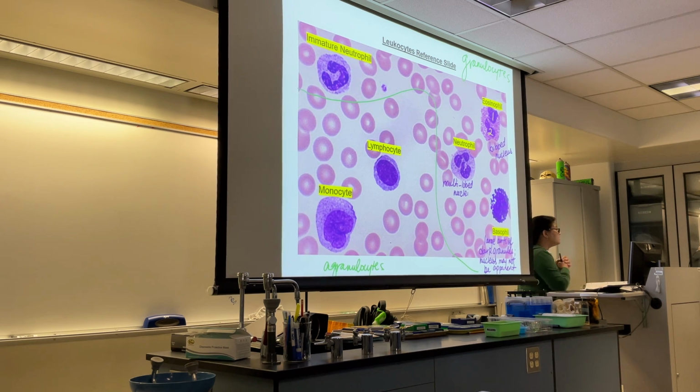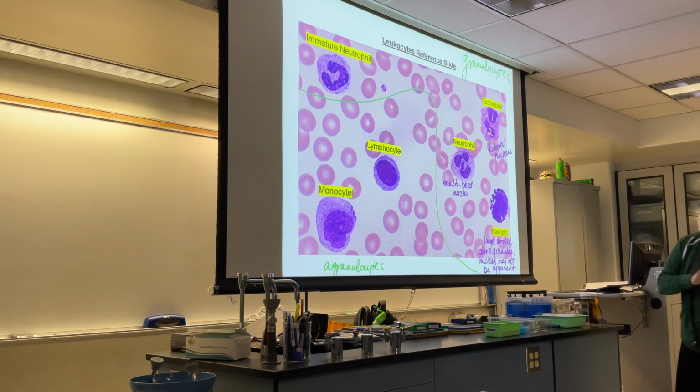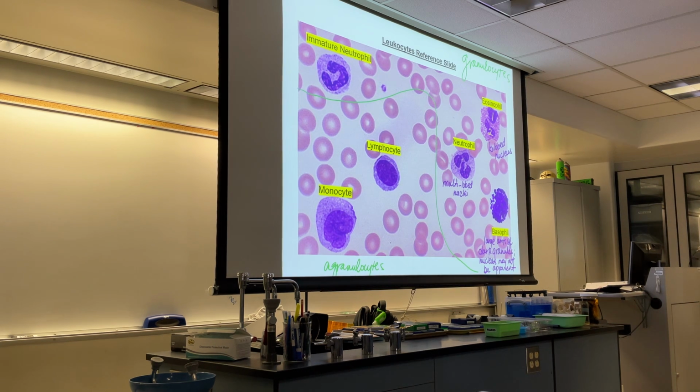Okay, so the basophils, these guys are going to be really easy to tell apart because they release really darkly staining granules. Does anybody remember what chemicals basophils will release? Histamine. Histamine, which is, what does histamine do? It bronchoconstricts. The opposite. Oh, vasodilation. You guys, basophils will release 2 main compounds.